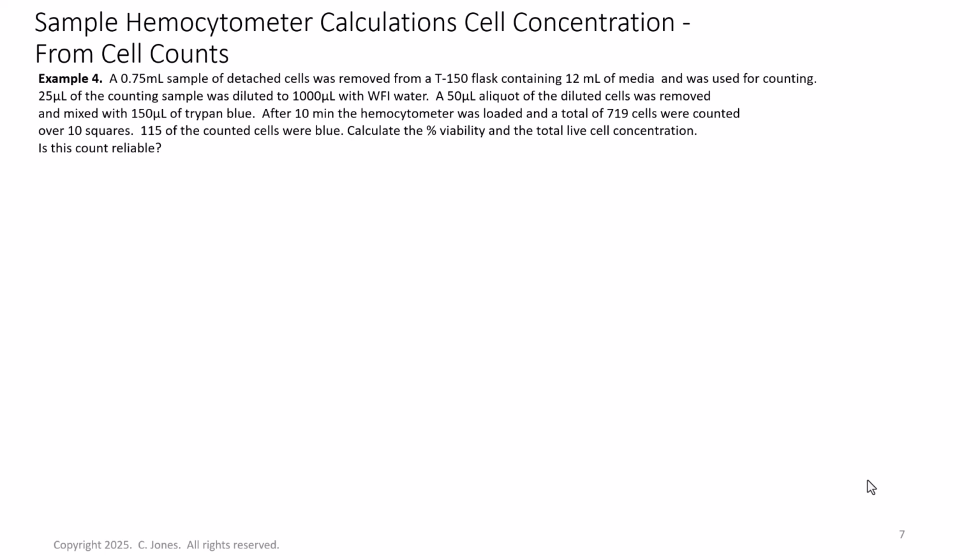Again, I like to illustrate the problem. It just helps me keep track of everything. So here I have 12 mils of media and a T150. That seems a little bit not enough media, but that's what the problem stated. Okay, we removed 0.75 mils.